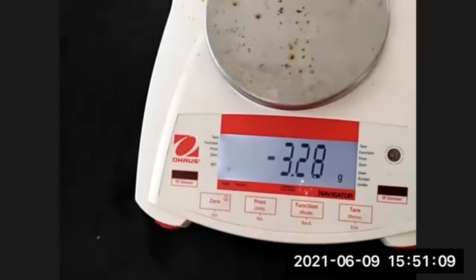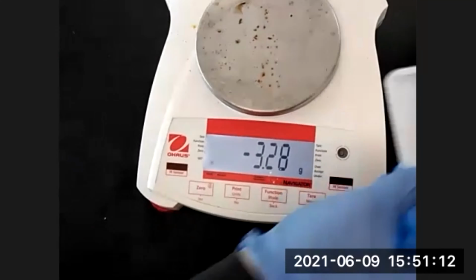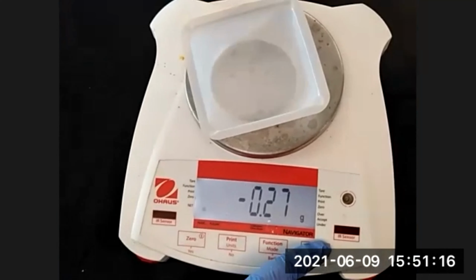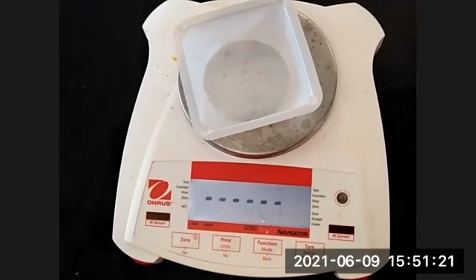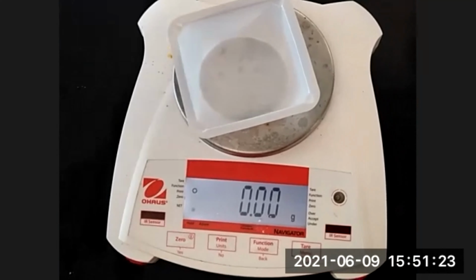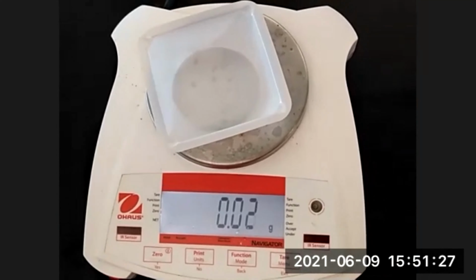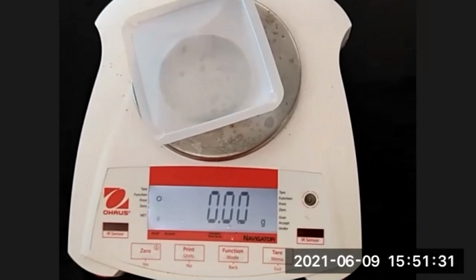So the first thing you're going to do is, once you get your mass of sodium bicarbonate, you're going to come and weigh out your amount of sodium bicarbonate. Make sure you tare the balance. Sometimes you may need to zero. Measure out the amount of sodium bicarbonate given to you by your TA.